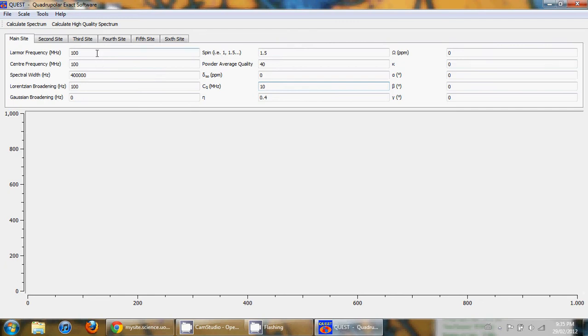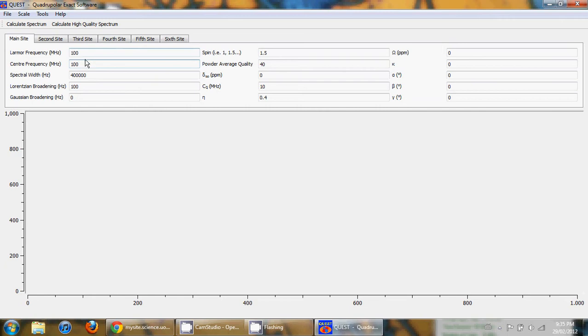The LRF and the spin of the nucleus can be set at the top of the screen, and the spectral window can also be edited by changing the center frequency and spectral width options.